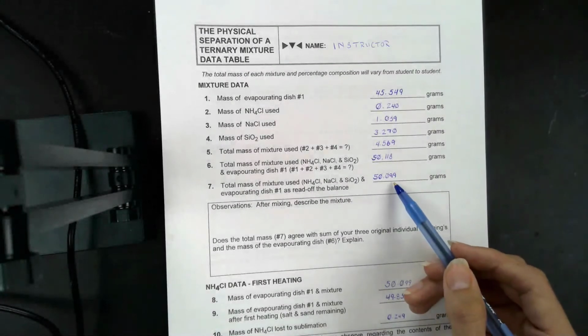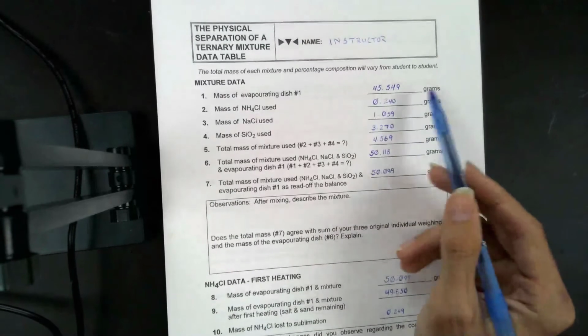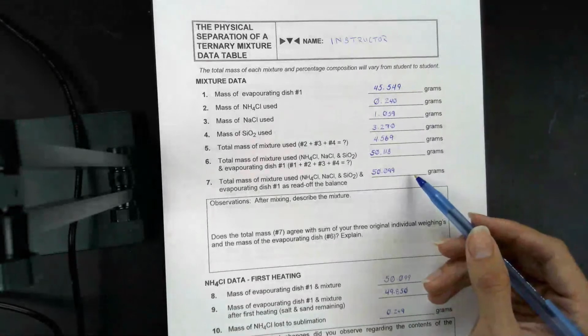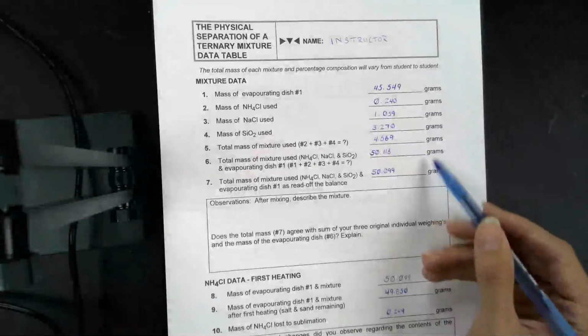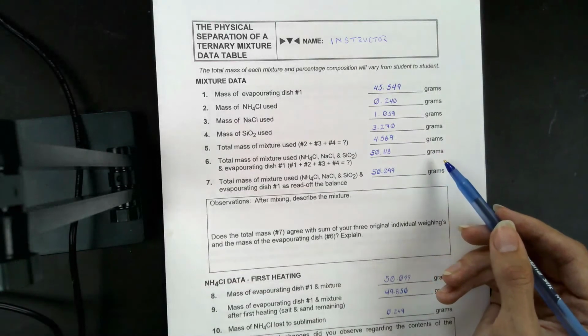When I weighed the dish with all three of its components, I didn't get the same value as if I just added all of them up on paper. And that's probably due to residual moisture. Although, because of the air currents in this room, it could also have to do with the way the balance was being affected by the currents at that particular point in time. So they don't quite match. They normally don't. And that's kind of why you're asked to do this both ways, is to illustrate that point.